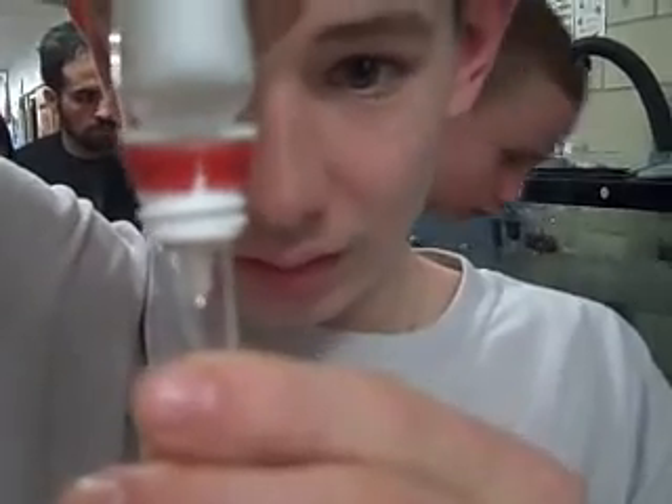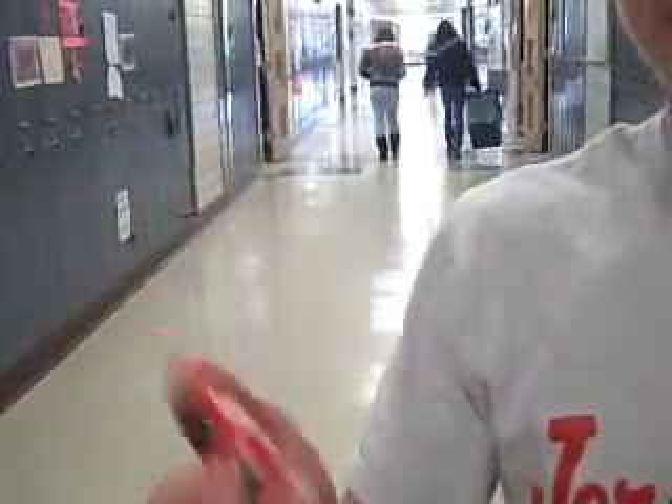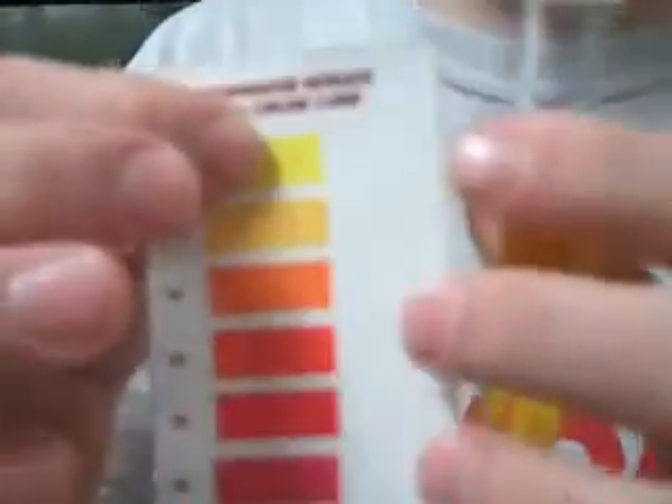Then you take ten more drops and add it again. Then you shake it for thirty seconds. Then you start the timer — you have to wait five minutes. This is what it's supposed to look like after five minutes, and it does.